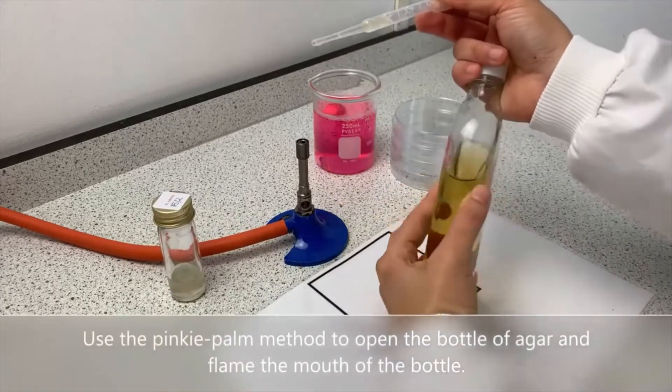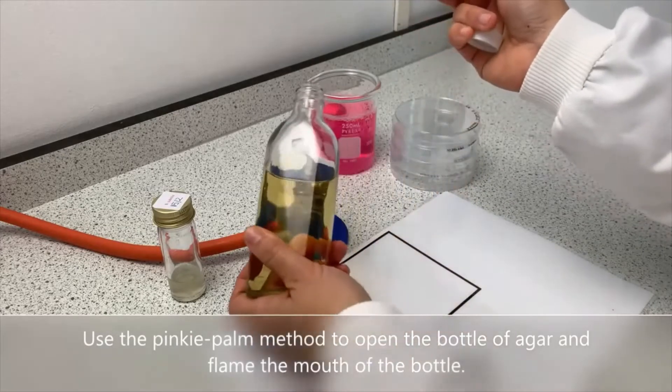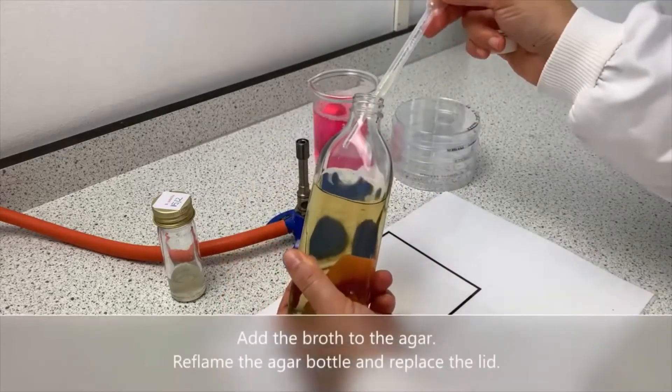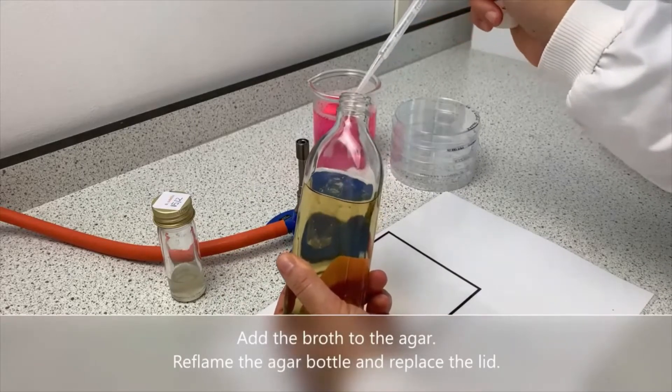Use the pinky palm method to open the bottle of agar and flame the mouth of the bottle. Add the broth to the agar, then reflame the agar bottle and replace the lid.